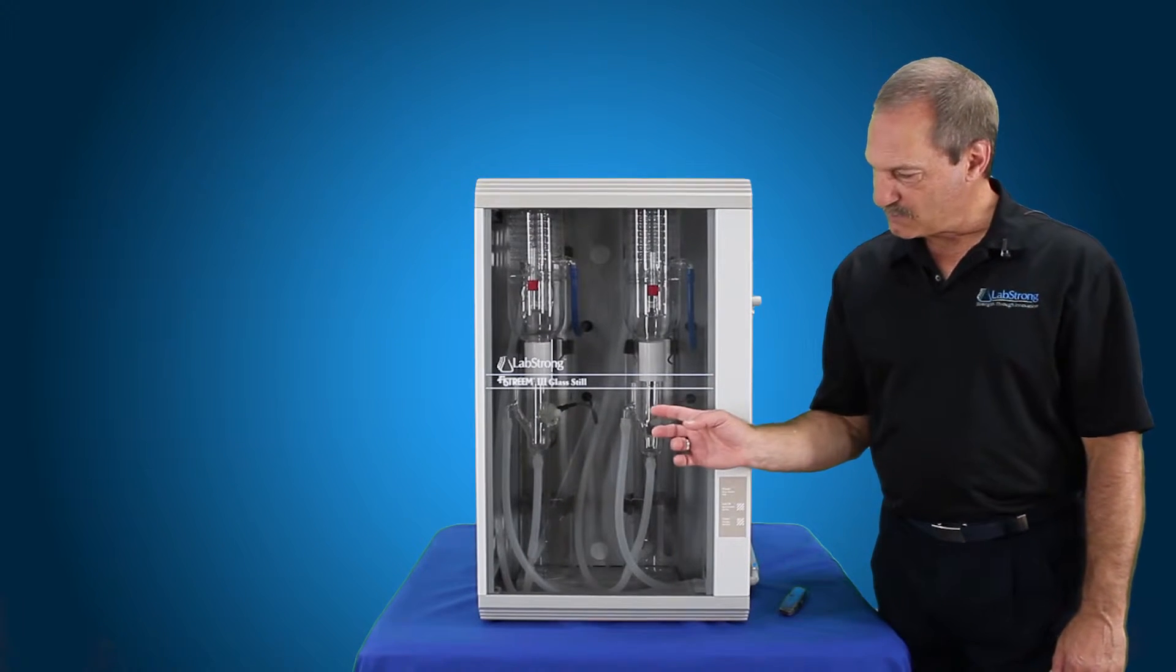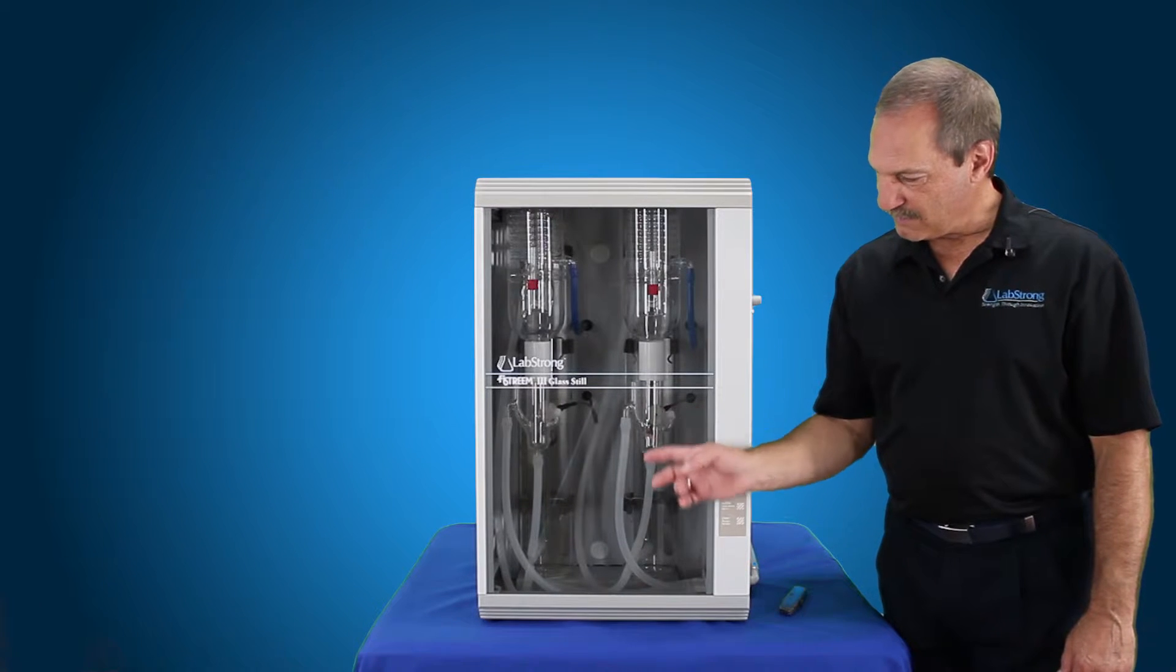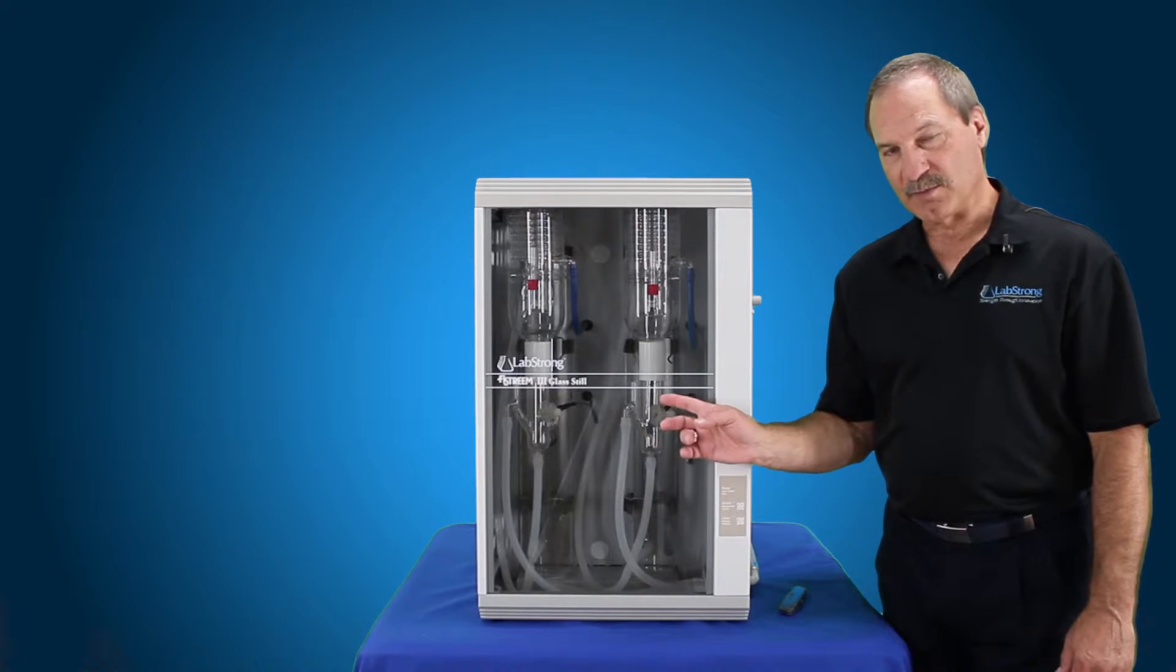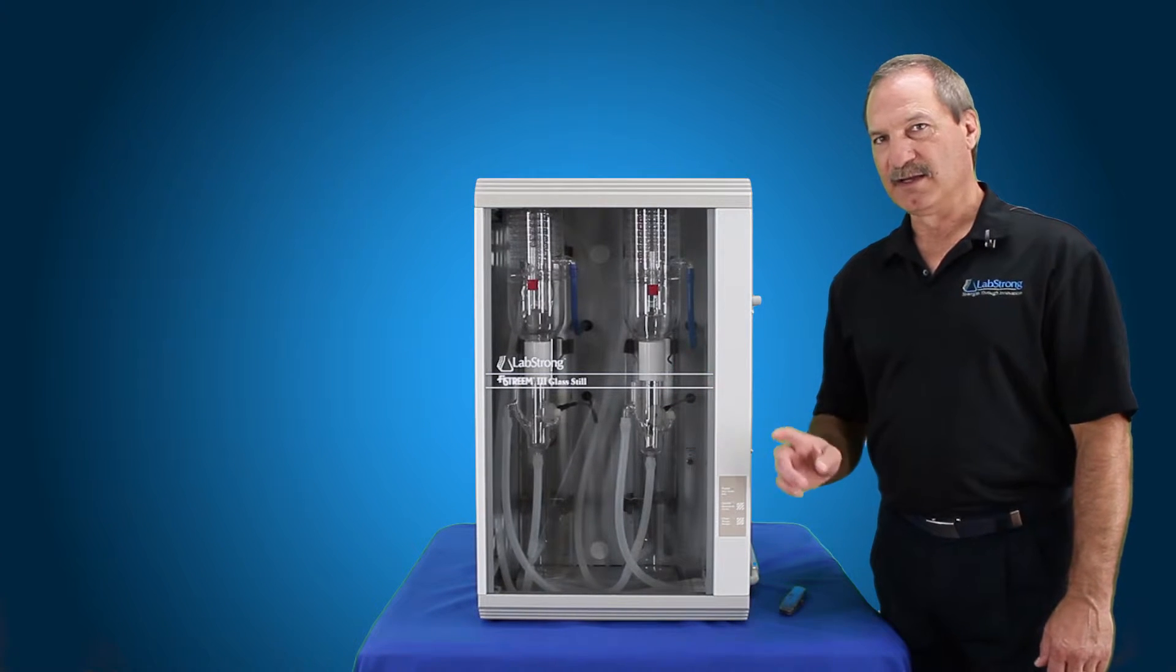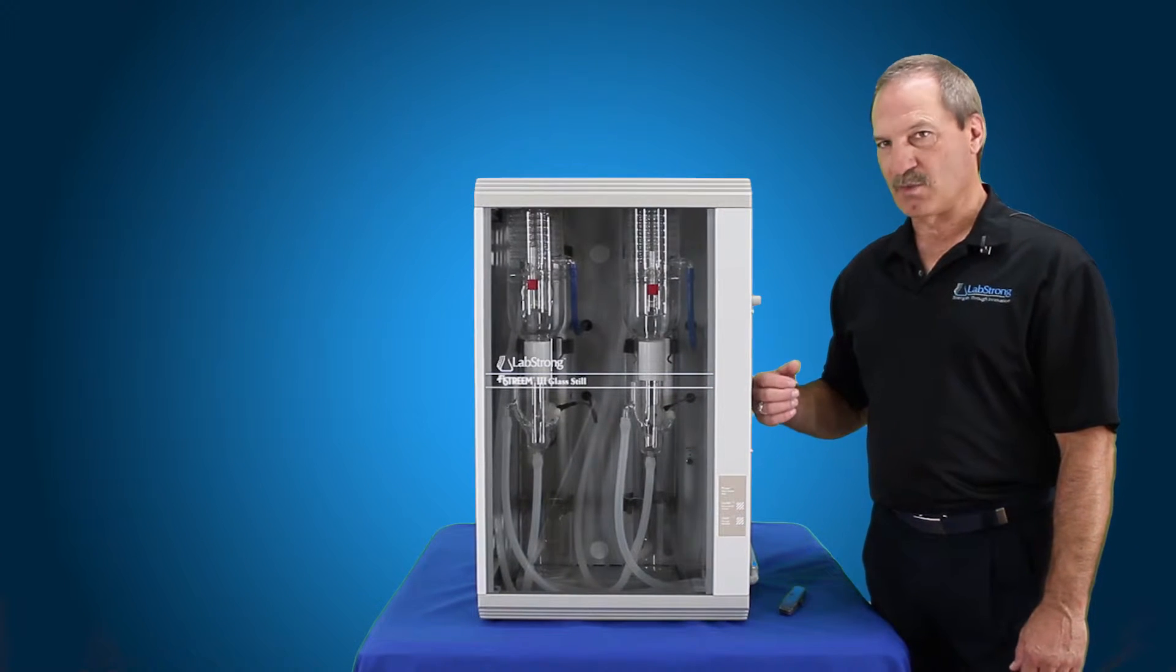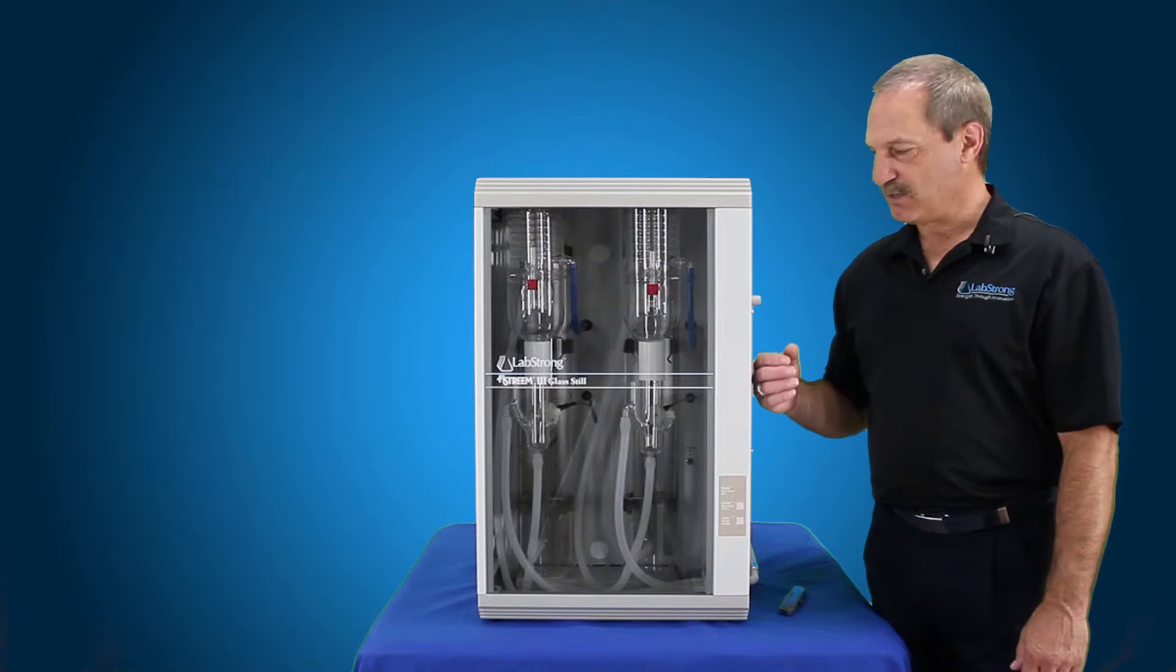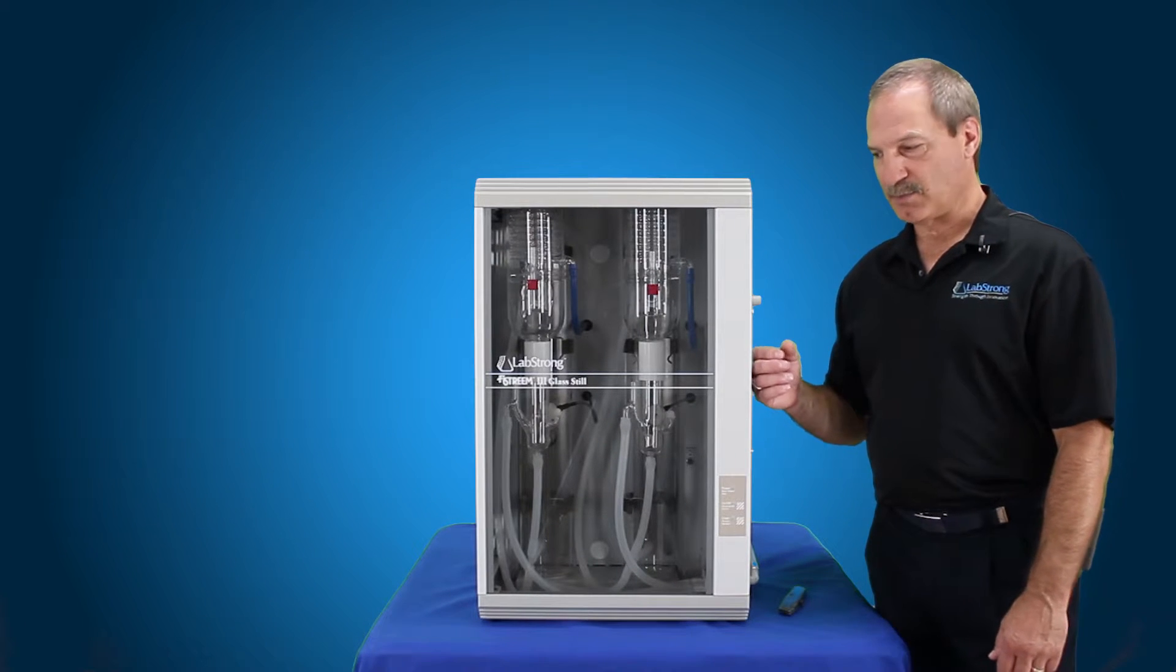We're going to show you how to replace the tubing that's already been in this unit for quite a while, and when that happens it actually adheres itself to the glass. First thing you want to do is always make sure that your water connection is disconnected and your electrical is disconnected.